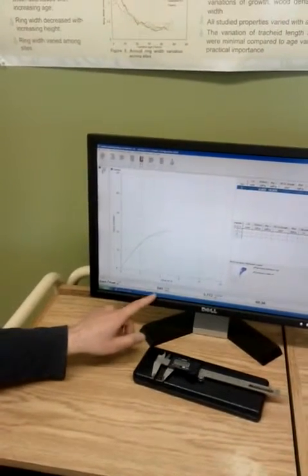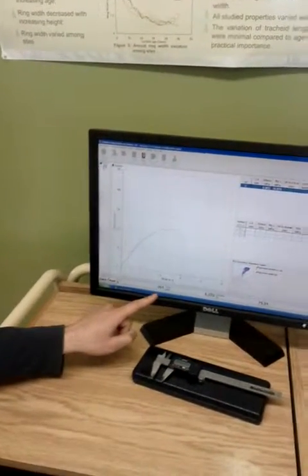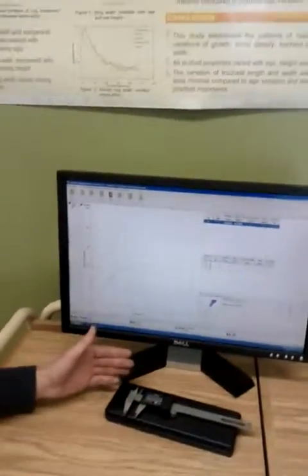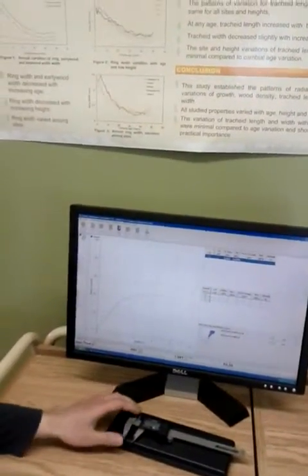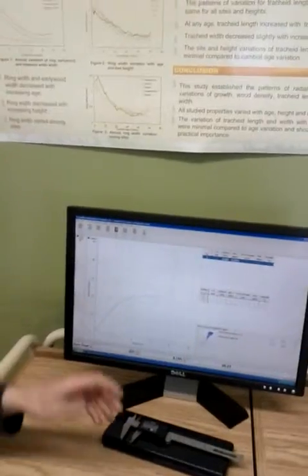So 950. At half of this, it will stop. Like 450, about. The test will end, as I put this criteria, but it could be something else. But WPC, usually they break very quick. It's brittle. It does not strengthen forever like plastics.